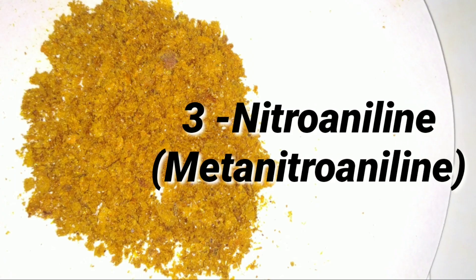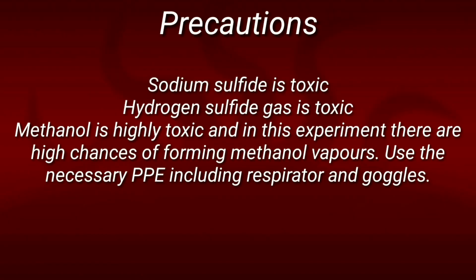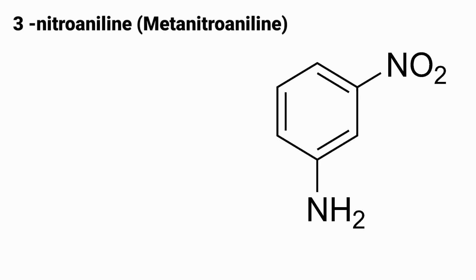Hello friends, in this video we will synthesize 3-nitroaniline from 1,3-dinitrobenzene. 3-nitroaniline is an aniline compound carrying a nitro functional group at the meta position, hence called metanitroaniline. I will be converting this to metanitrophenol in one of my upcoming videos.